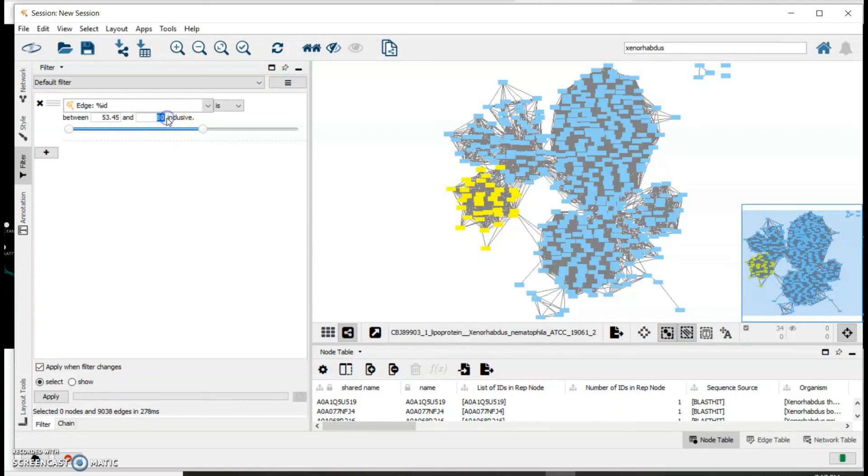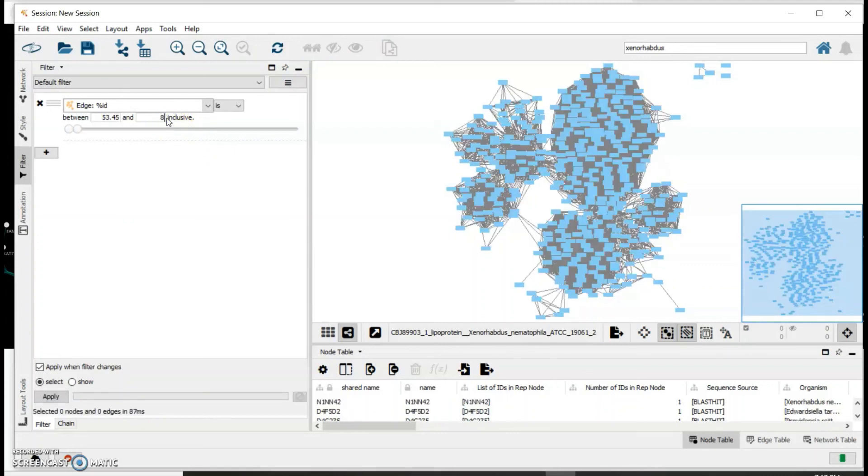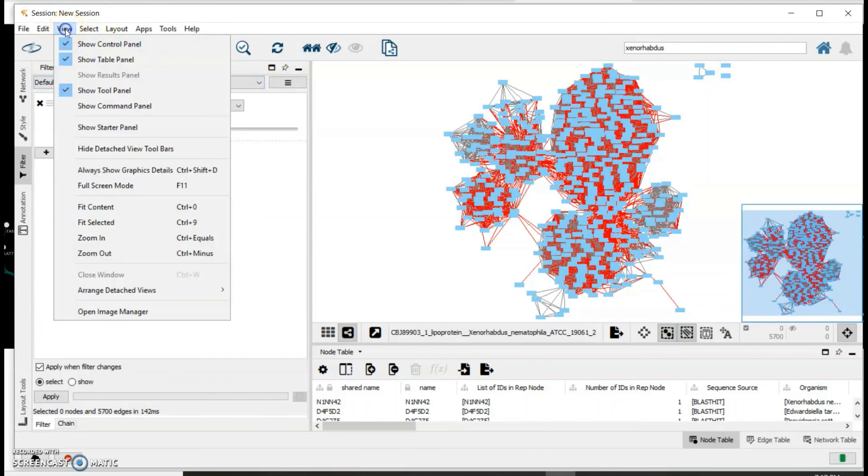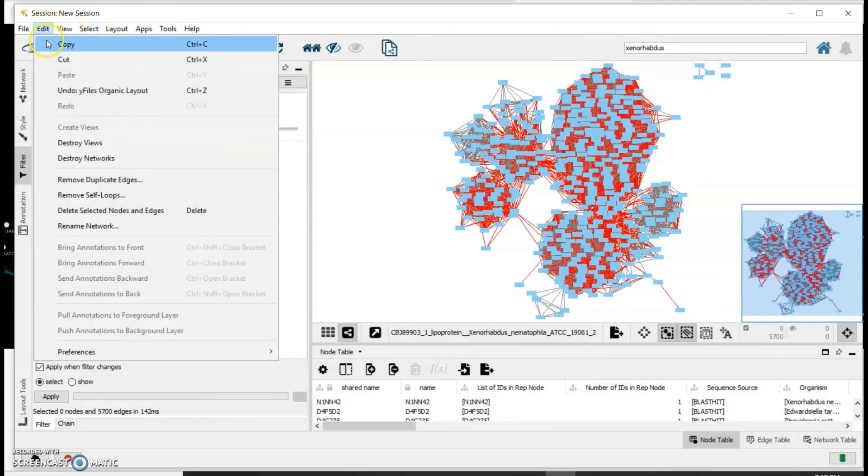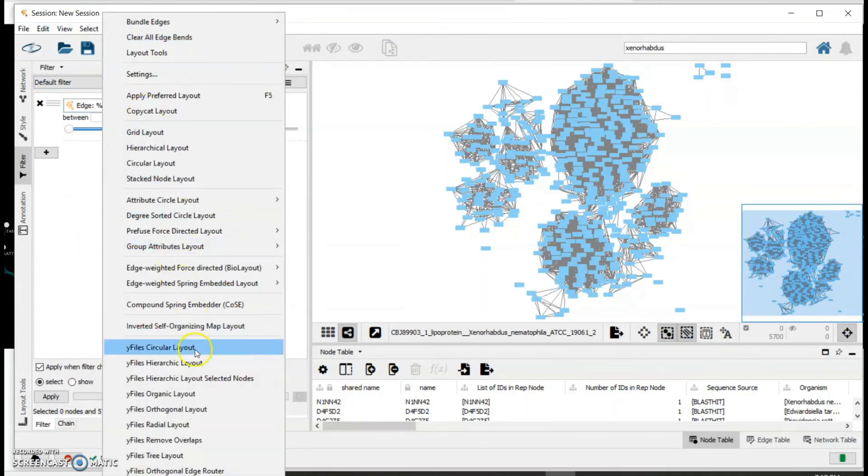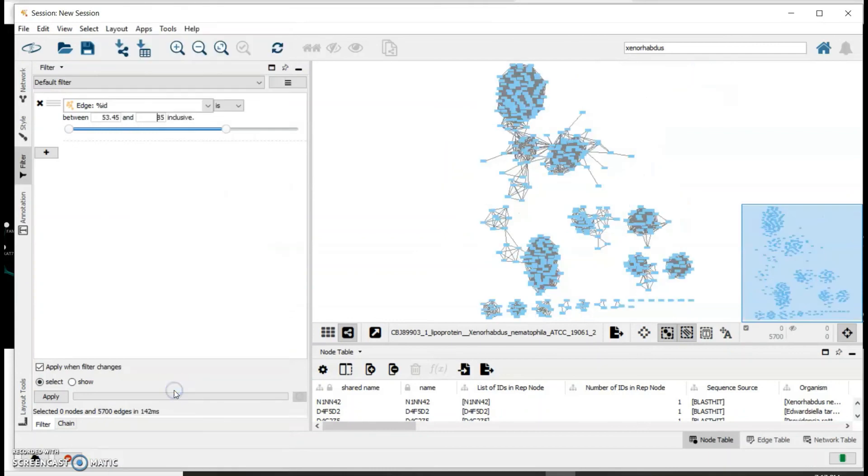And so we can increase this to 85. Again, destroy these edges by deleting them, and then we adjust the network.